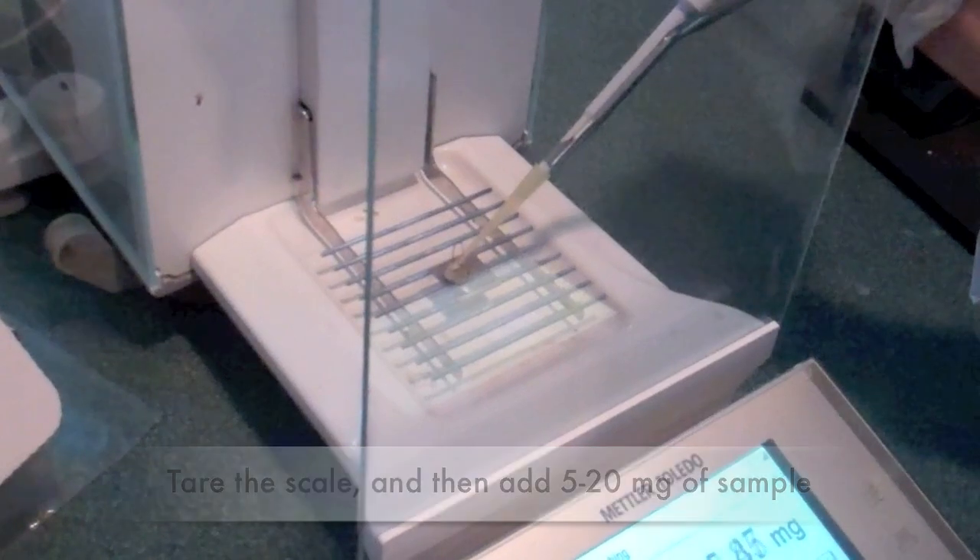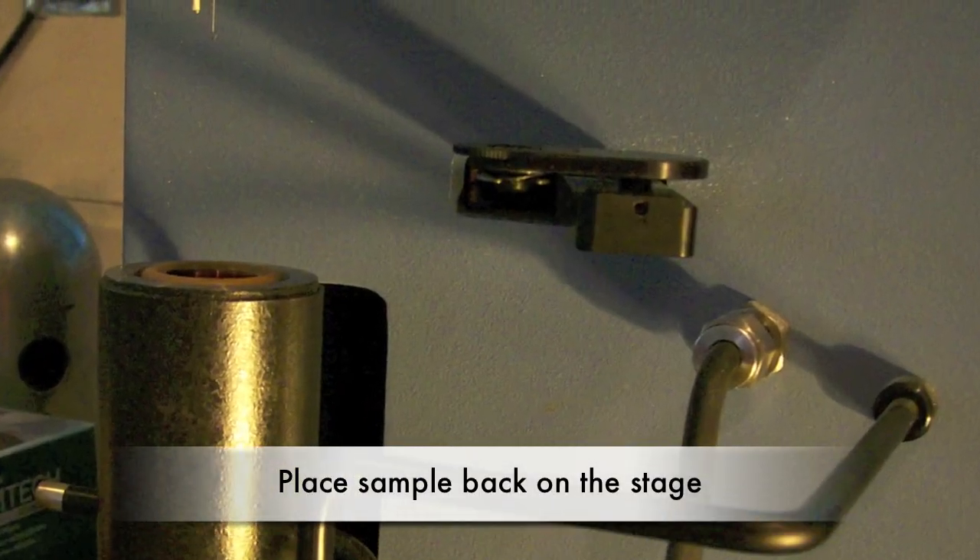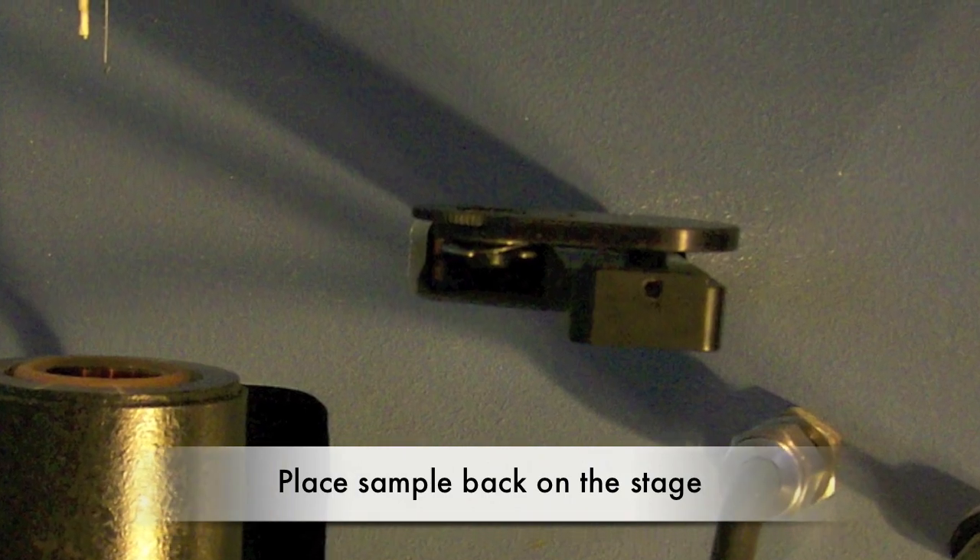Tear the scale and then add 5 to 20 milligrams of the sample. Use about 20 milligrams for volatile samples and 10 milligrams for solid samples. Grab the pan with the tweezers and place it back on the TGA stage.